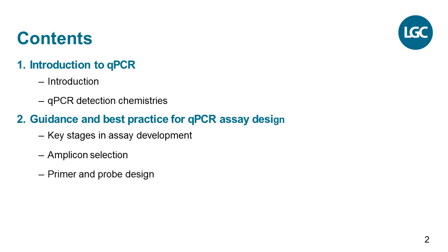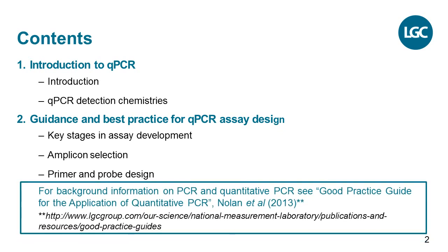It is assumed that you have a working knowledge of PCR. However, if you require further information, please refer to the 2013 publication Good Practice Guide for the Application of Quantitative PCR by Nolan, Huggett and Sanchez, which is free to download at the URL displayed at the bottom of the slide.